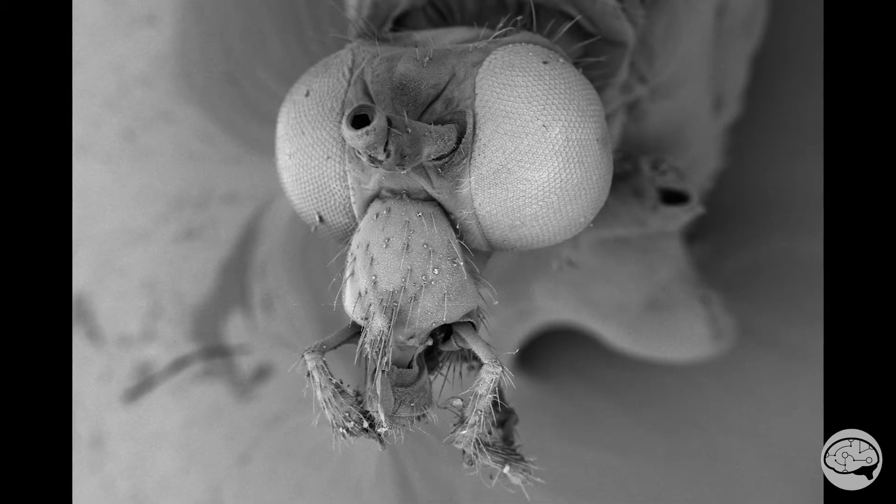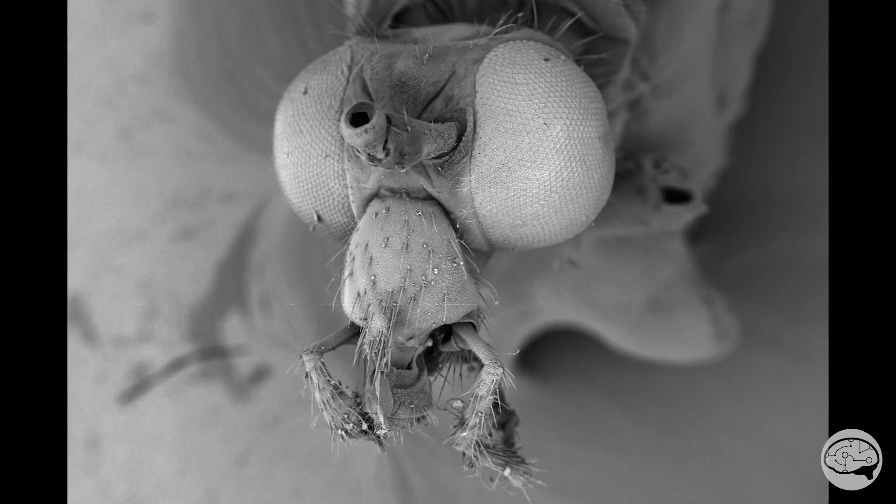Image capture is the first important step in this colorization process. To be able to colorize this correctly, we'll need three to five different images of the same area. First, we'll start off with what I call the master image. This is just a normal image of the sample. This can be an SE or BSE image. I prefer it to be an SE image when possible, but if you're dealing with a non-conductive sample, or are running the instrument in variable pressure mode, then a BSE image is fine too.